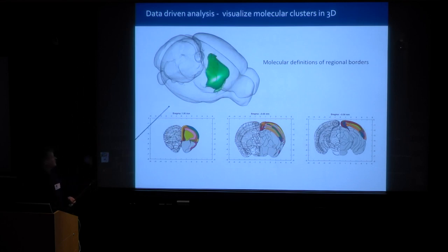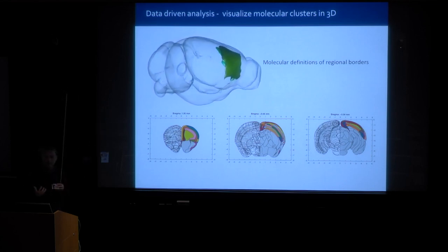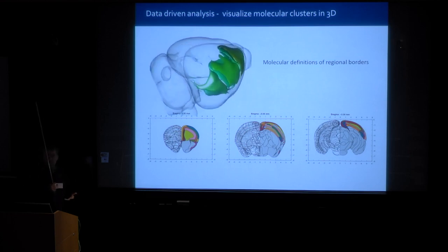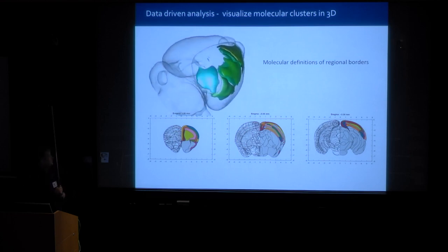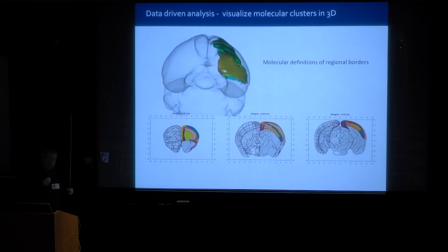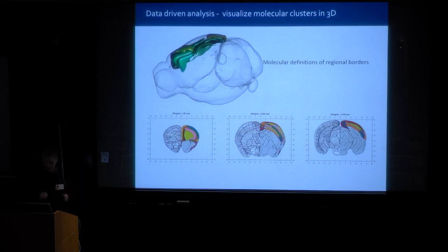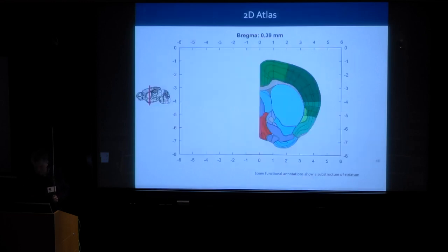So here you could actually see how we are able to build up the sheets of gene expressions along the structure of the brain. This is actually the first time that the brain will be molecularly defined, unbiased of human interpretation of the brain structure. And you could see how it makes sense. This is a very, very long movie since we are building up the entire brain, so I will not show all of it, but you get the feeling of how they superimpose over each other.